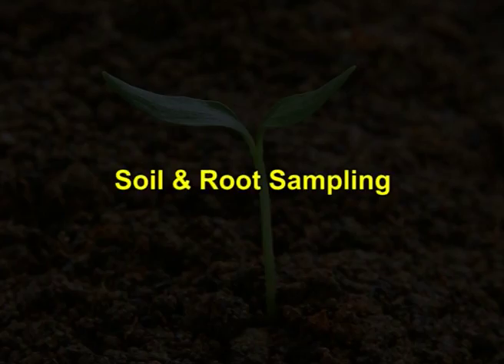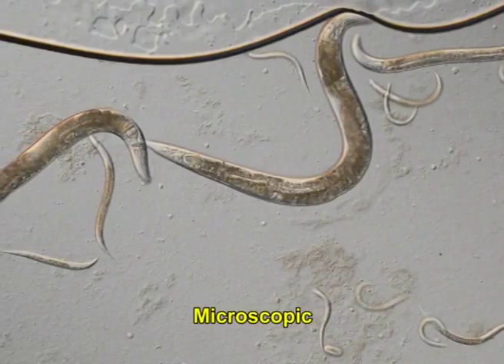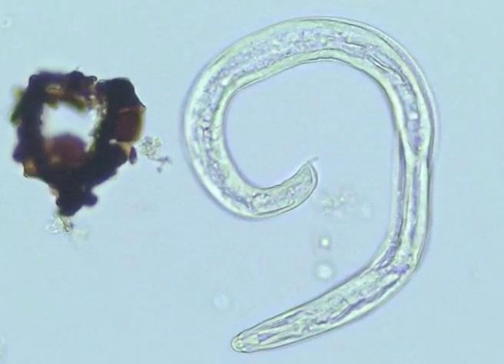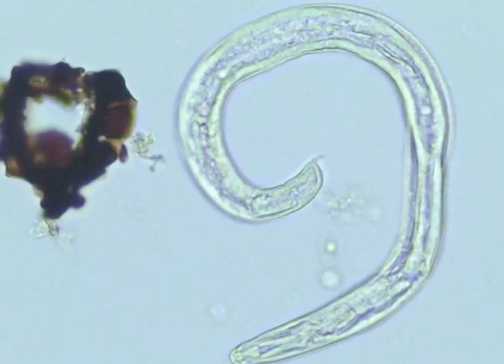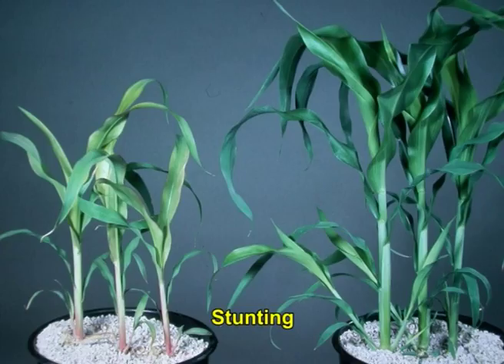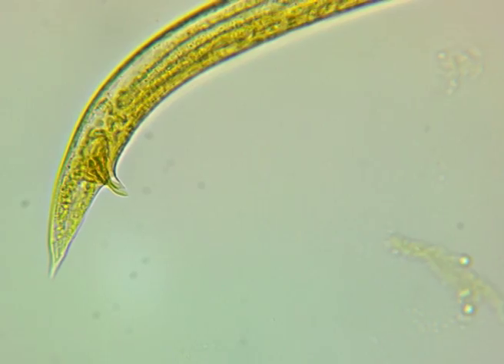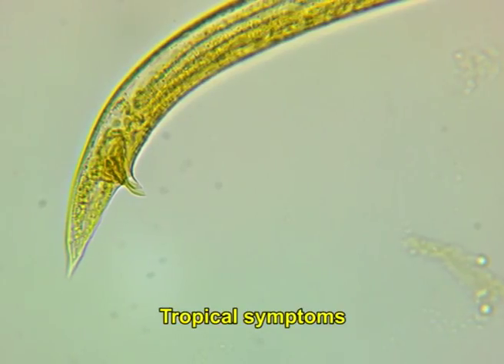Soil and root sampling. Owing to their microscopic nature, nematodes cannot be observed with the naked eye. Over a period of time, this microscopic organism can build up to high population levels and can result in significant economic damage. This includes yellowing, stunting, wilting, root abnormalities and reduced yield. But these tropical symptoms alone cannot ascertain nematode damage to plants.